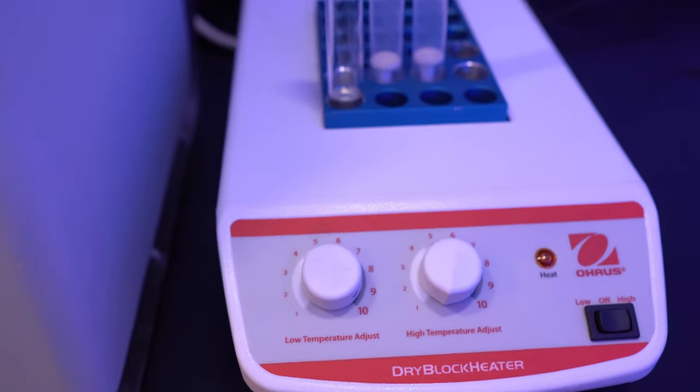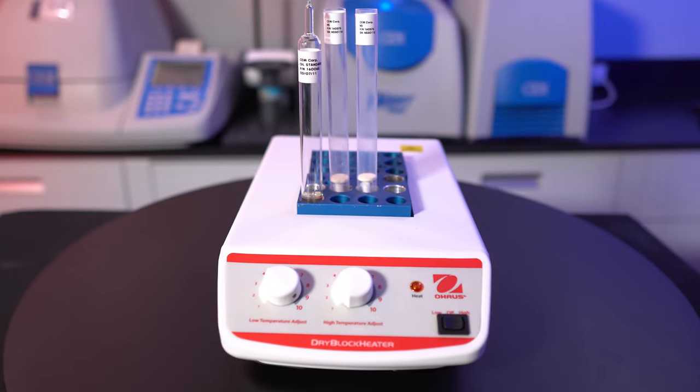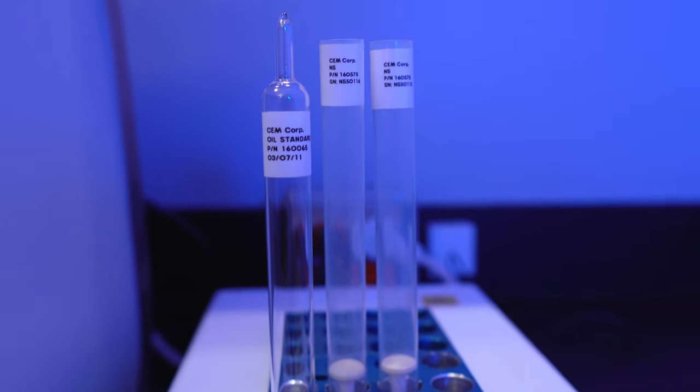The SmartTrack Processor is where all the electronics are held for powering the SmartTrack and computer. Finally is the dry block heater, used to keep the normalization and frequency oils at 40°C. These oils are used during routine maintenance, which is recommended to ensure optimum performance of the SmartTrack.